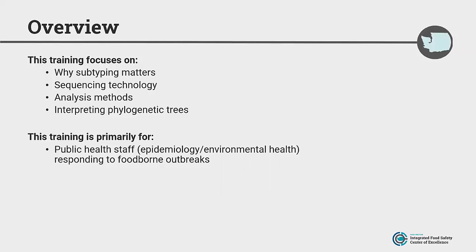So today our training will focus on why subtyping matters, sequencing technology, analysis methods, and interpreting phylogenetic trees, and it is primarily for public health staff, both epi and environmental health, responding to foodborne outbreaks.